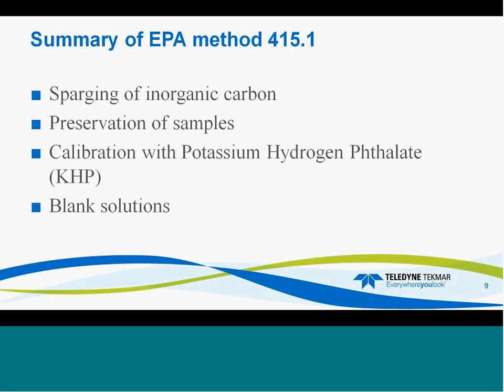Samples need to be preserved if they are not analyzed within 2 hours. So if you have a sample and you're going to analyze it right away, fine, but if it's going to be the next morning before you get to it, 415.1 says it's preserved with acid. In addition to preserving it with acid, it's encouraged that you store it in a cool area that's protected from sunlight and atmospheric oxygen.